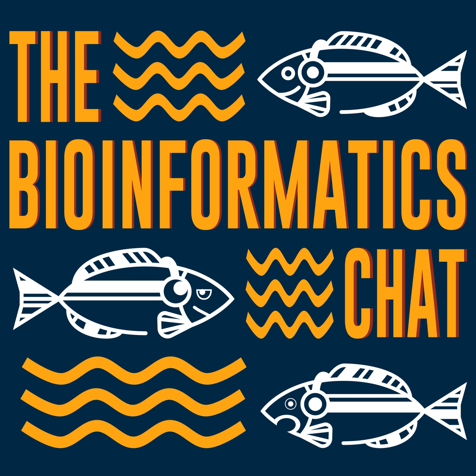So I think in early studies for this PBCR tool, they were assembling Drosophila, and Drosophila is one of the most important model organisms. They reported that they needed a few CPU years to assemble it initially. And they obviously had a very powerful computing cluster to perform this assembly. This was because the Drosophila genome has a lot of repeats, and the more repeats you have, the more difficult your alignment becomes. And of course, it is optimized now.